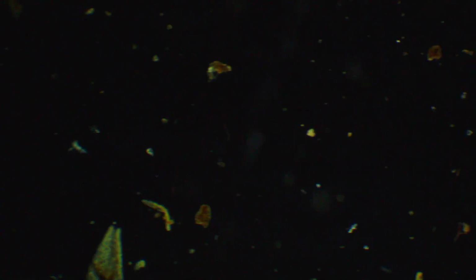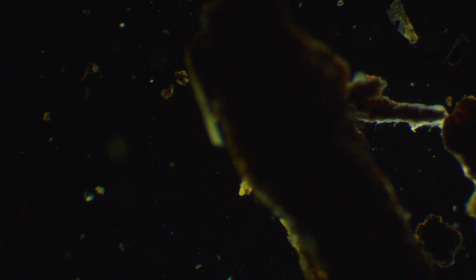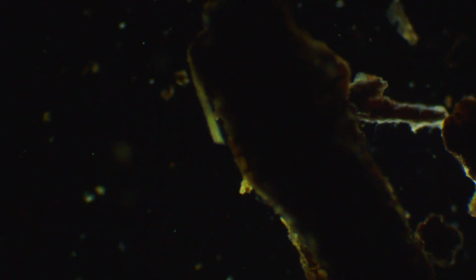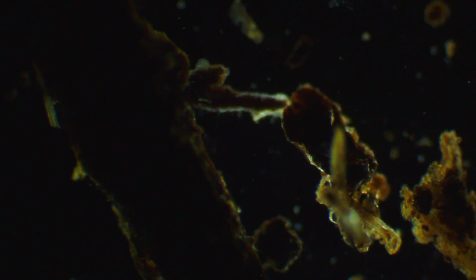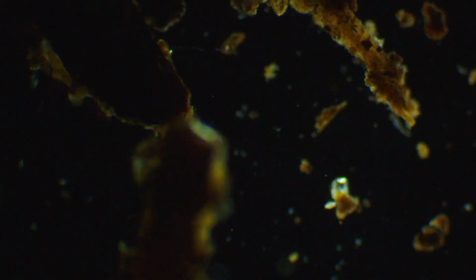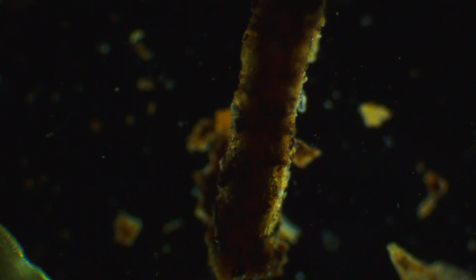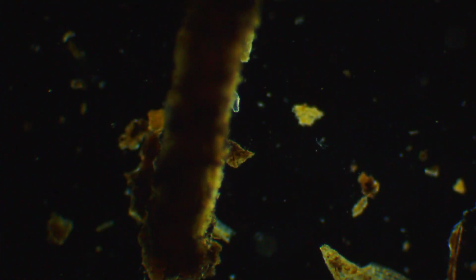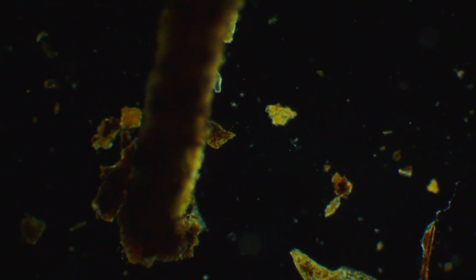There's a little swimmy thing. Little slender swimmy thing. See, there's a little more material in here. I'll shake it around, see if anything's hiding in there. I mean, it almost looks like there's, look, what's that? I can't tell if there's dirt stuck to this, which could be, or if there's little dudes hanging out.